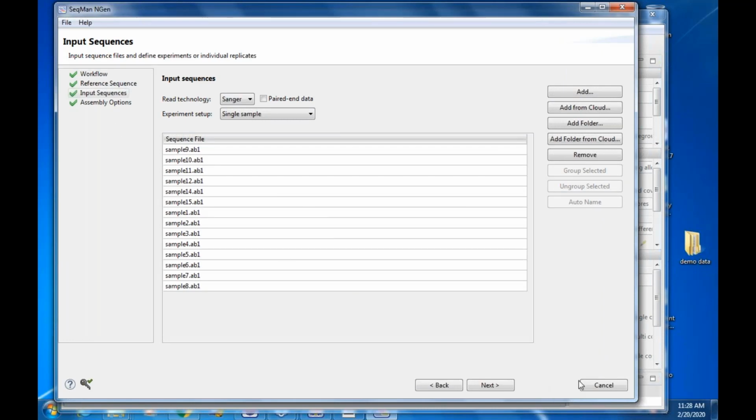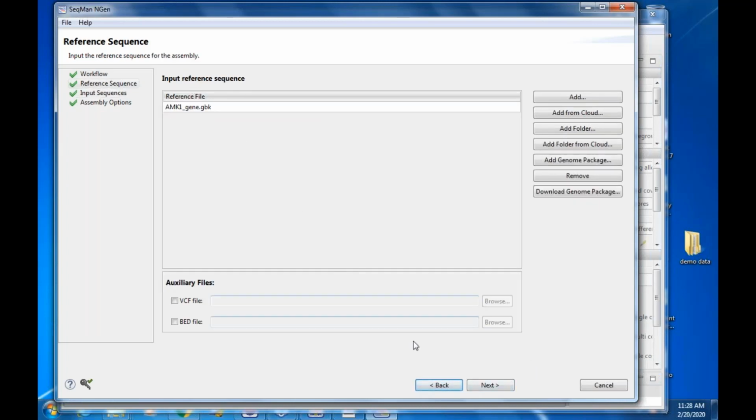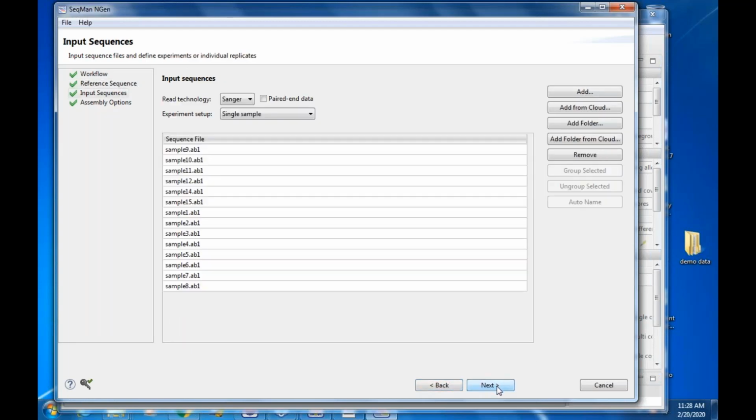You'll notice that there is no Run Now button yet, and that's something that we will have. Again, this data is still small. The gene isn't that big. We don't have to worry about hardware so much. If I had a chromosome though, on a small laptop that might be a problem if you don't have any space on a C drive, so then you want to go through the wizard and have it make sure that your hardware has enough space to do a larger alignment. So you will see this Run Now button in the next major update. It'll allow templated Sanger to be reduced down to two wizard pages, would be the goal here.